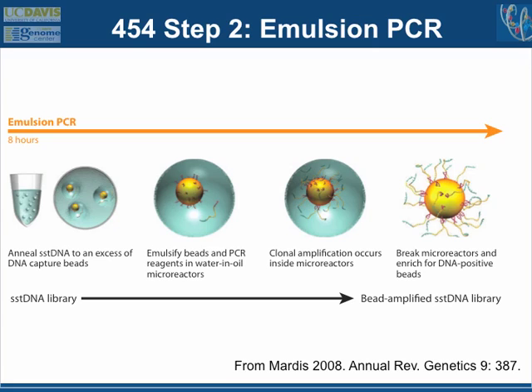So you do this, you try and, in essence, estimate how much DNA you have, and then you try and generate these emulsion products such that there's a single piece of DNA. You do basically a Poisson statistical expectation such that most of your little emulsion beads have 1 piece of DNA in them. Not 2, then you'll have a big problem with your sequencing, and not 0, then you're going to waste money.